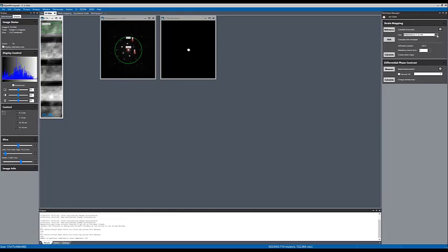You can do that selection here in this dropdown. So if I had other reference diffraction patterns, I could select those. The important thing is to make sure that the acquisition conditions, such as camera length, are all the same for these two data sets so that you can use the reference diffraction pattern from the other data set for this data set.